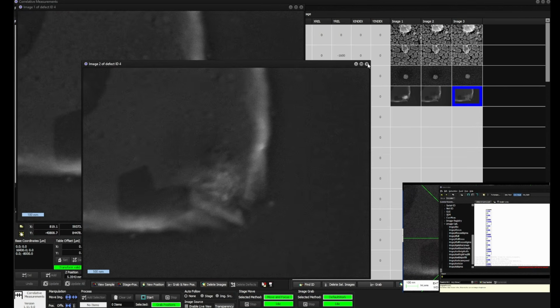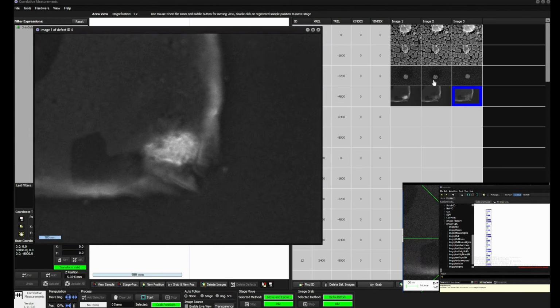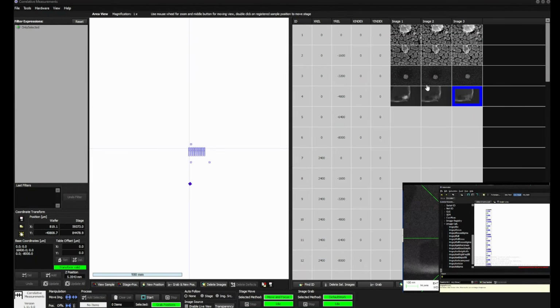But depending on the time and how good this is needed, you can see a larger usage of time can yield improved image quality. But you see the functions work reproducibly and can really improve the image quality for automatic imaging, even though you have such different conditions like we see here in this example.